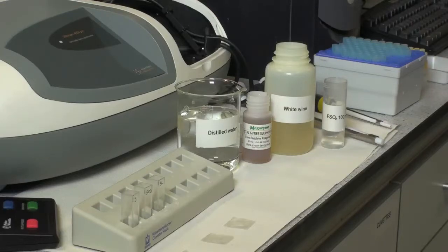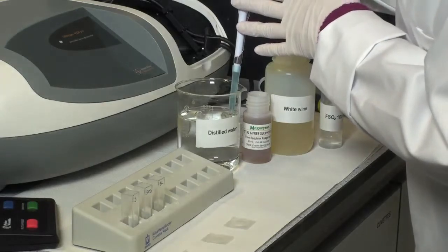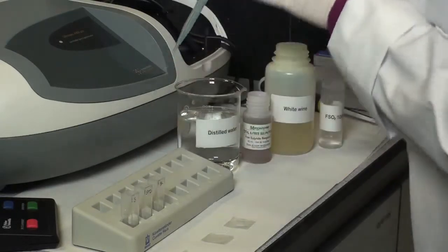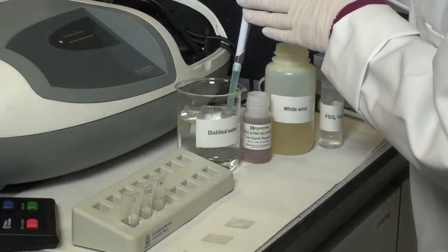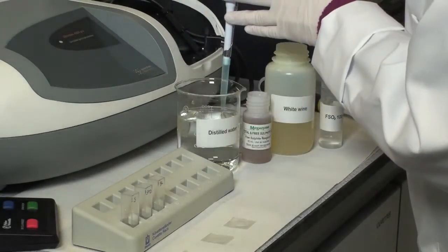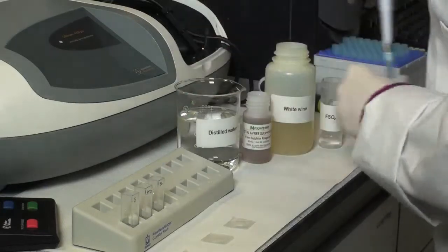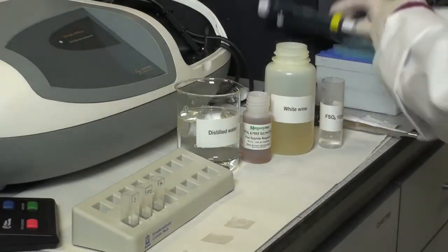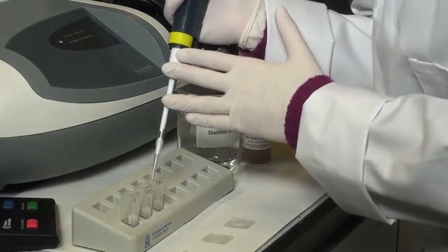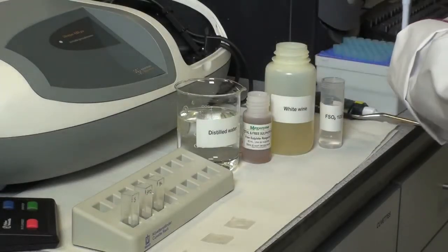To perform the assay, pipette 1 millilitre of distilled water into the sample cuvette and 1.05 millilitres of distilled water into the blank cuvette. After the addition of distilled water, add 1 millilitre of Free Sulphite Reagent 1 to each of the cuvettes.